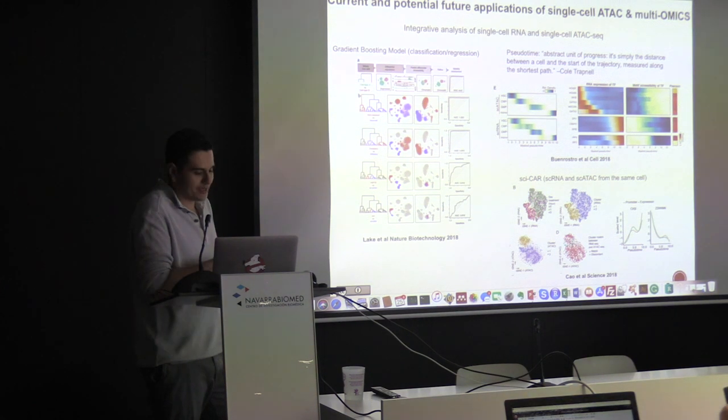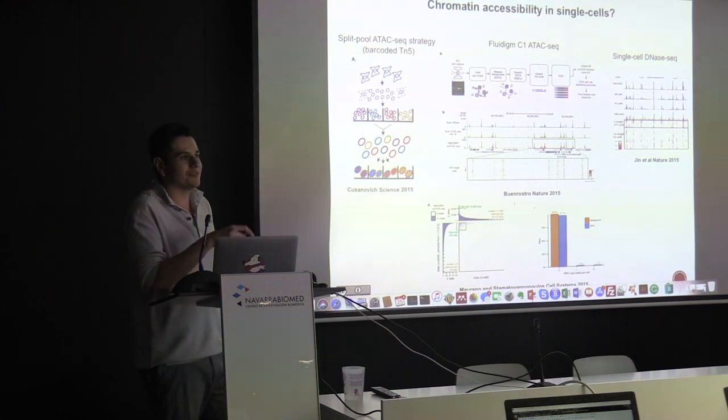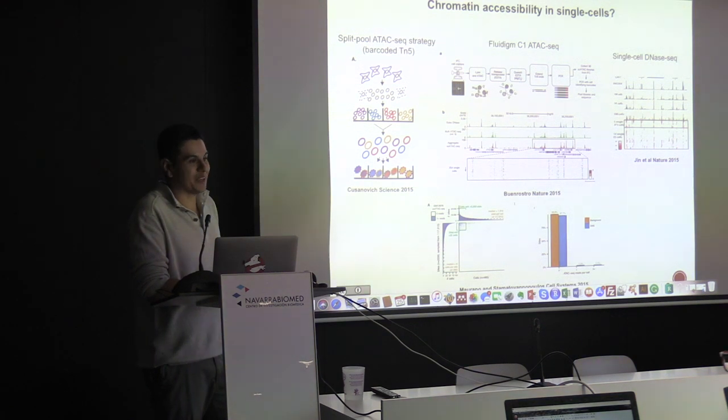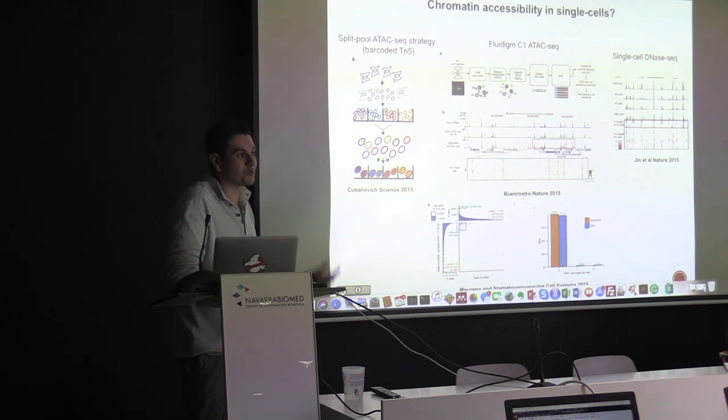So as soon as I saw these come out, I was in my graduate study, so I did single cell ATAC-seq for STATegra. And when I first saw the data, I couldn't believe it because it was very, very sparse. So I was observing accessibility of OCRs in 2 to 5% of my cells that I thought were really robust in the bulk data. And so I knew at that time that anything less than 1,000 or 5,000 cells was just not going to be useful in that way.